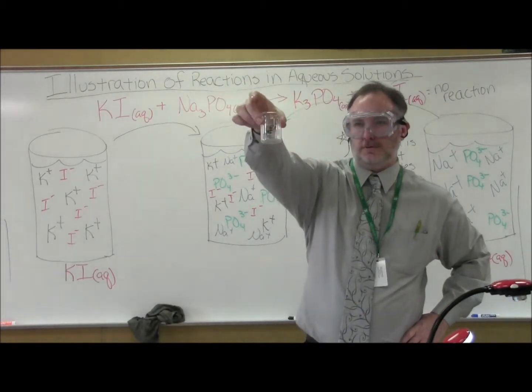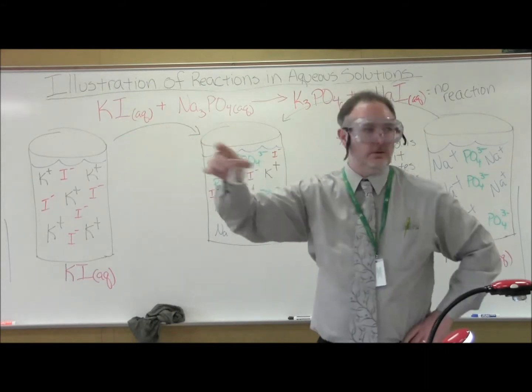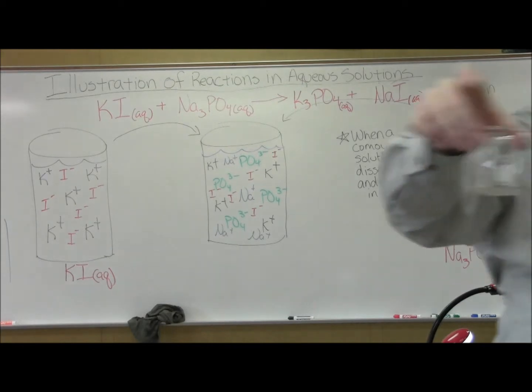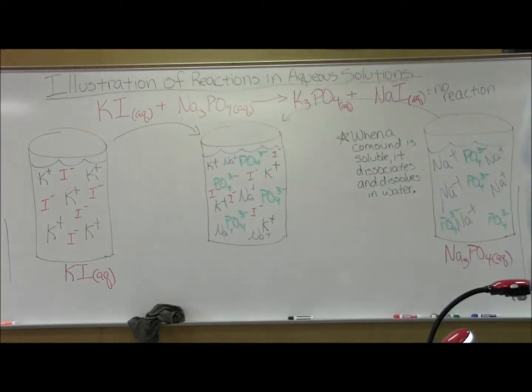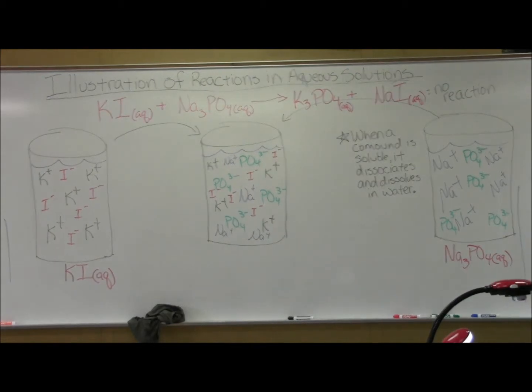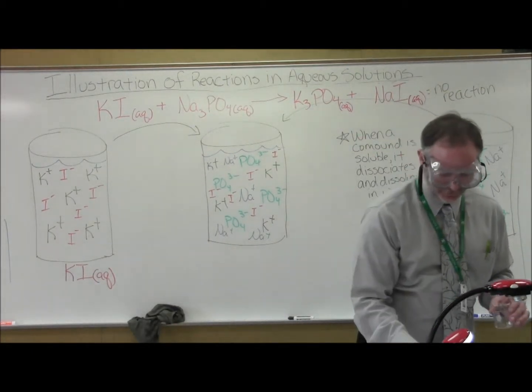Clear liquid, are you able to see that clear liquid? You guys see that clear liquid up? Clear liquid. I know, I'm a great actor. I am the man. Alright. And it is on video forever.